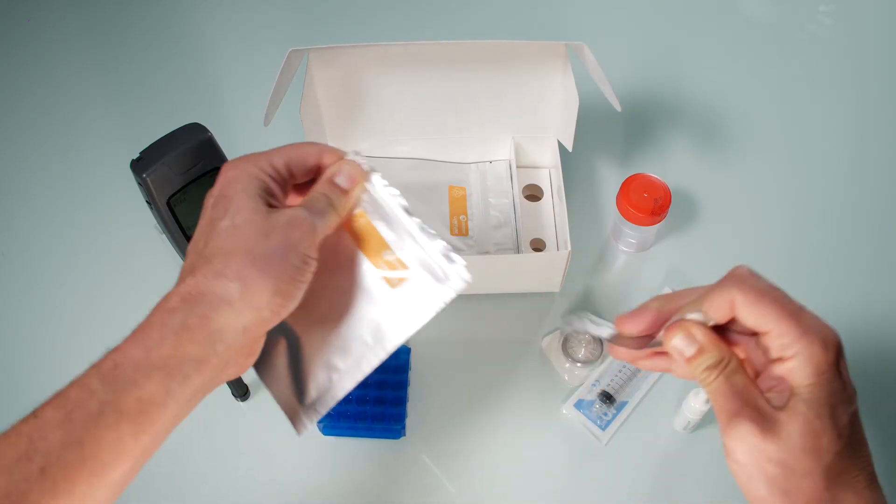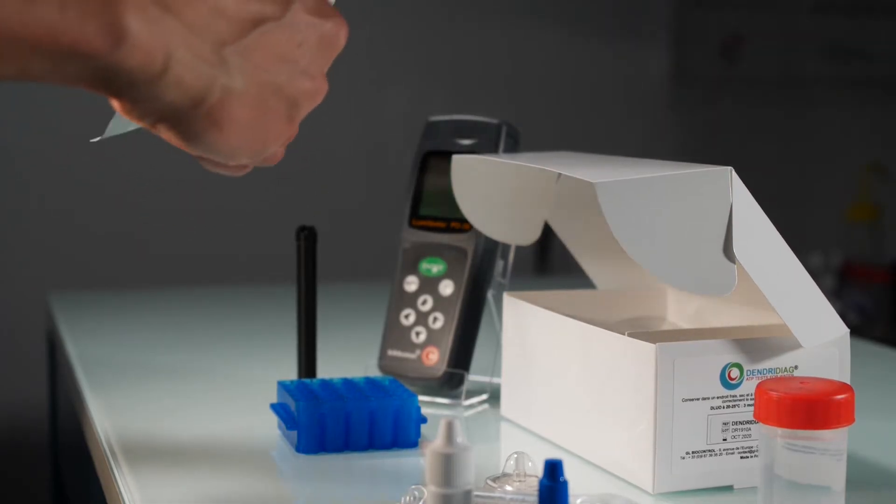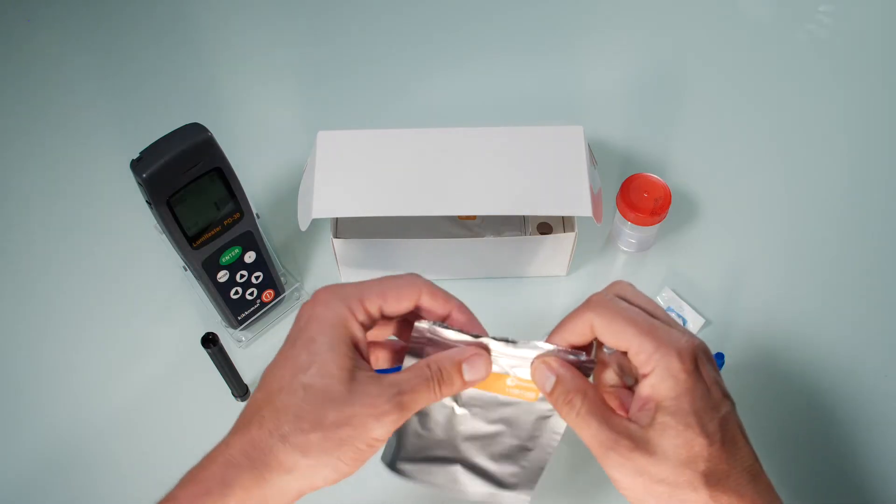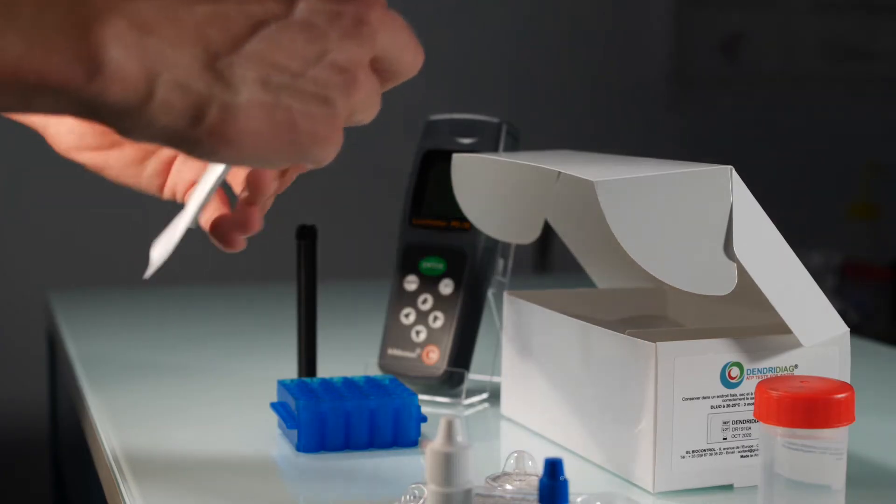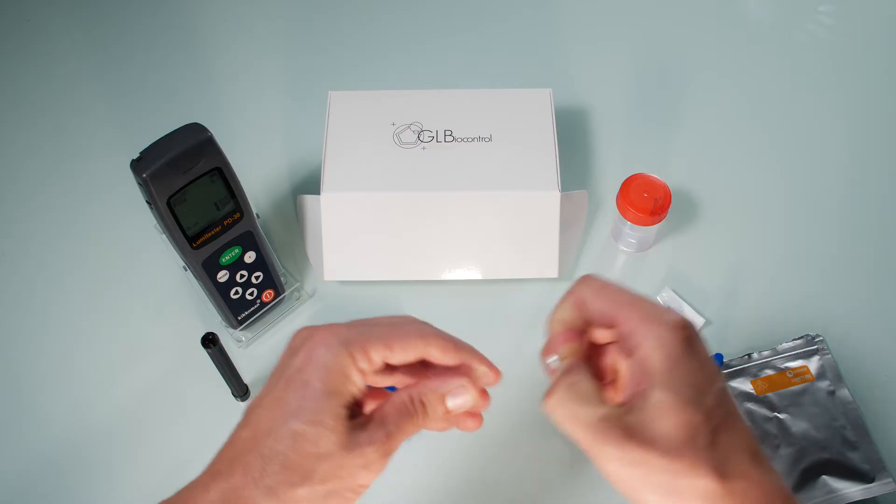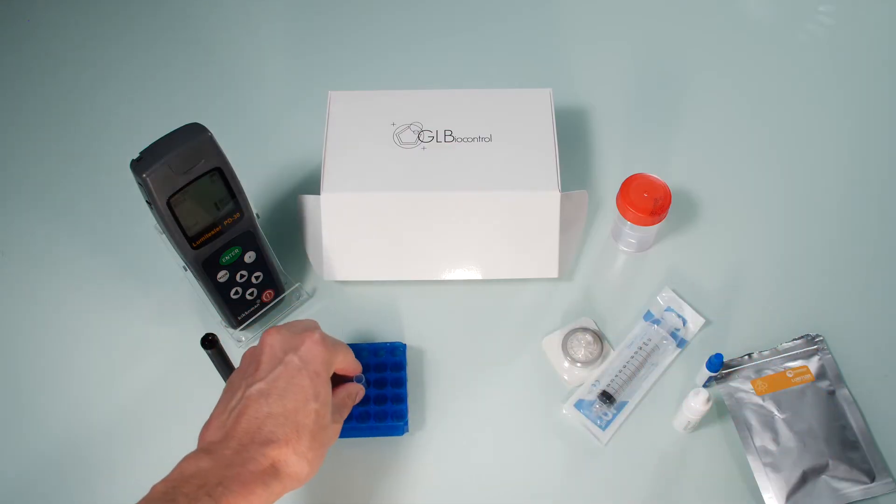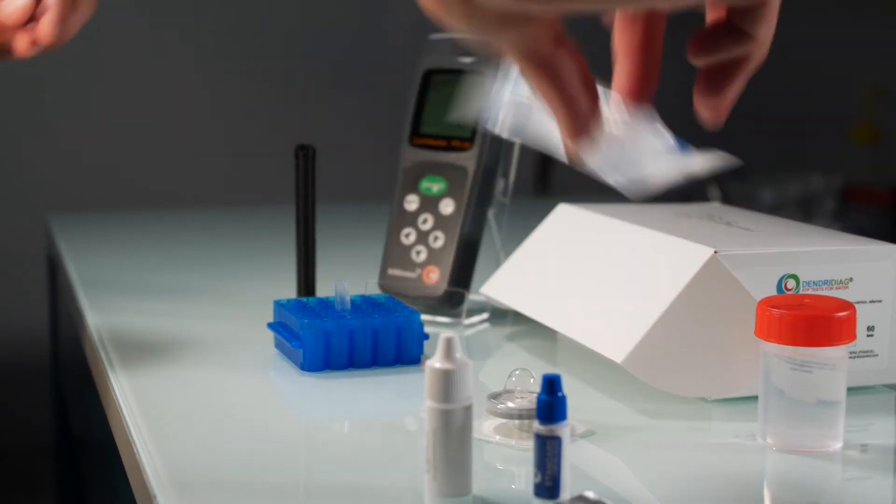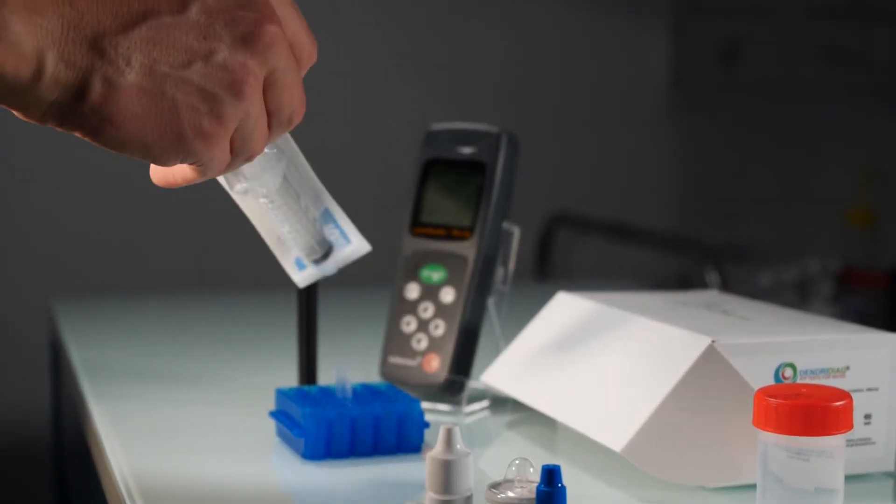Open the lumi tube pouch and remove one tube. Ensure that you firmly reseal the pouch. Peel the foil lid from the lumi tube and put it in a rack. The tube contains a small white tablet containing enzymatic compounds.